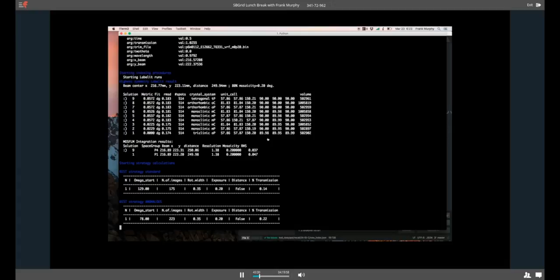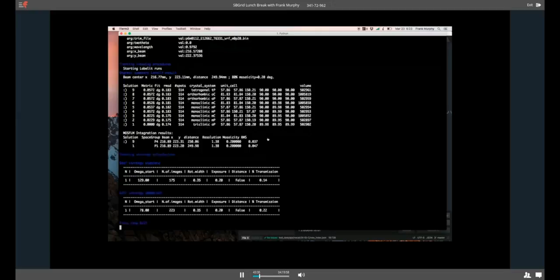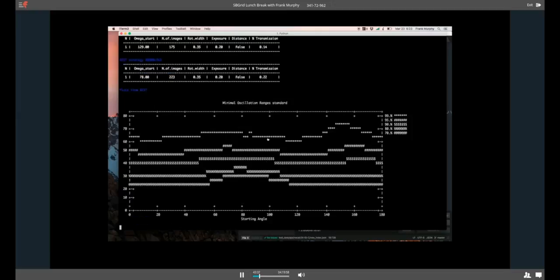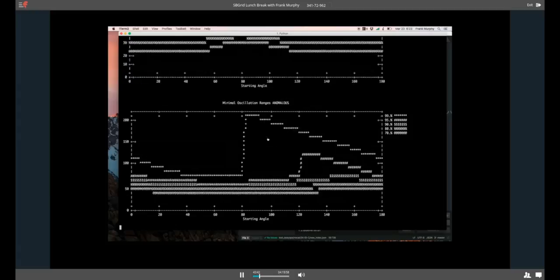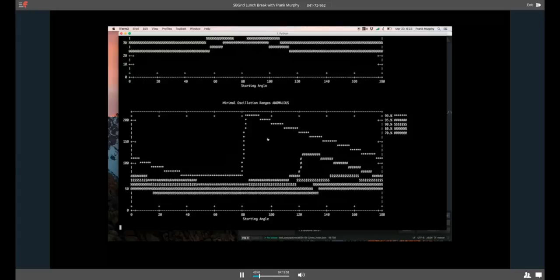And then runs strategy calculations using the program BEST. And if BEST fails, as it does sometimes, it will run a MOSFLM strategy as a backup. So, you should get results. It also does those plots. So, it gives you minimal oscillation ranges. And then, in this case, the anomalous had a little more texture to it. So, it gives you the normal and the anomalous.